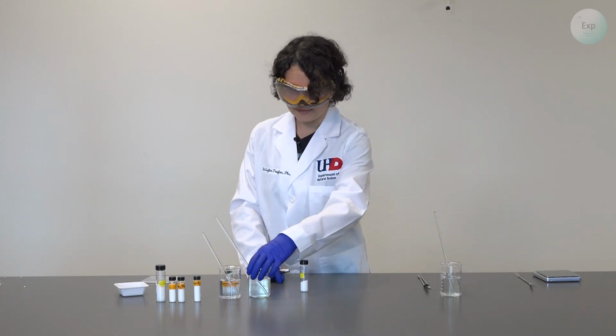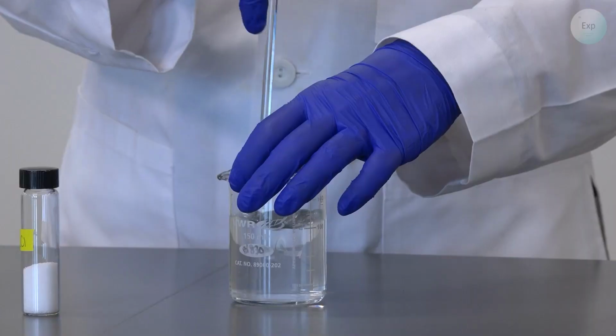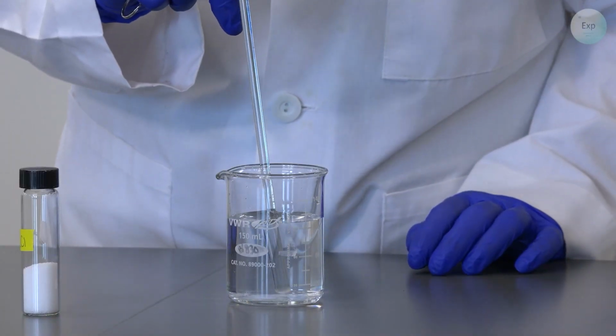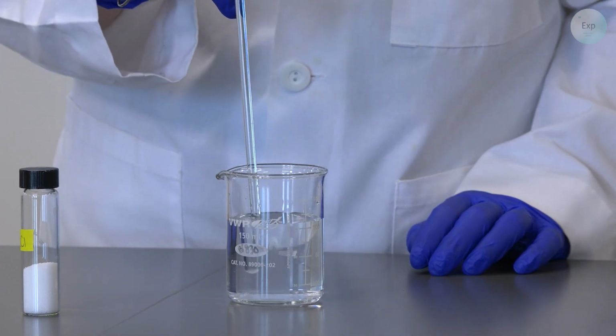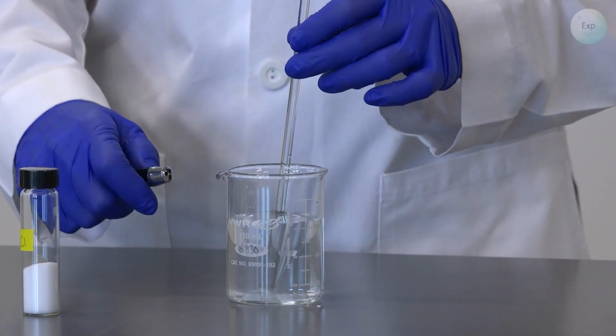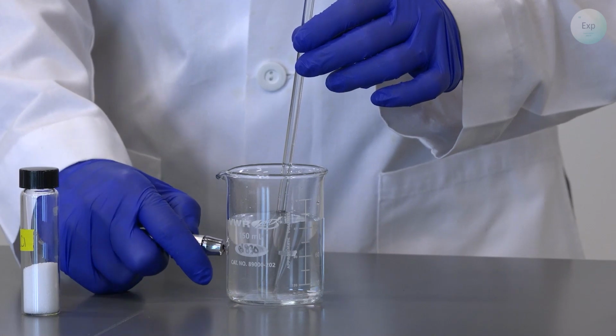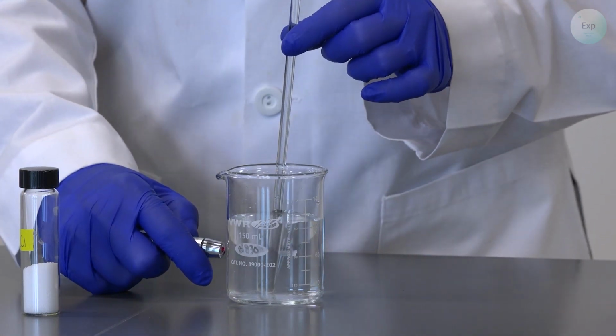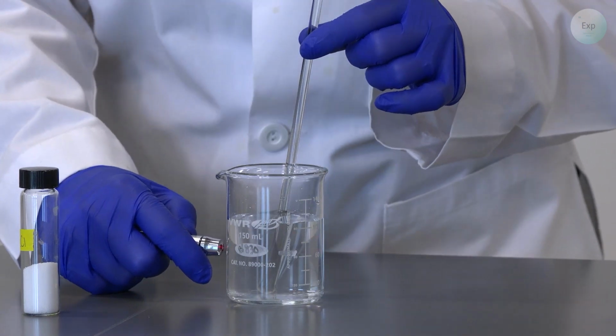We can do the same thing with calcium chloride. Mix it in real well. First, we check for any visible signs of calcium chloride particles on the bottom. There are none. So now we check for the Tyndall effect. It is not observed in this case either.